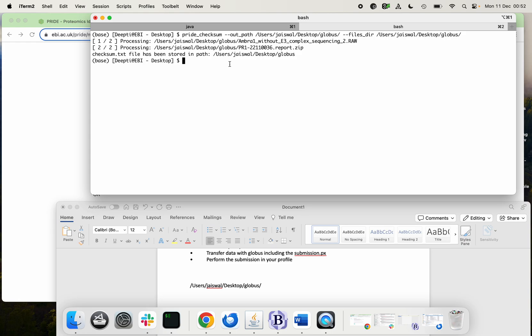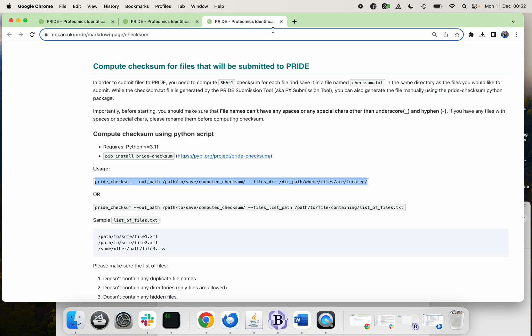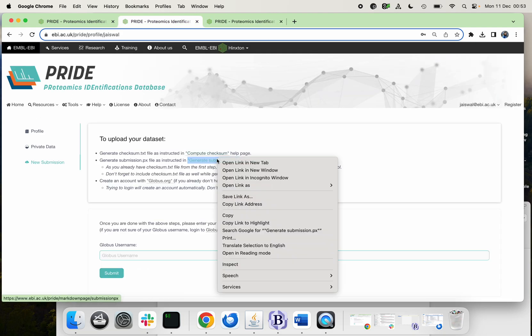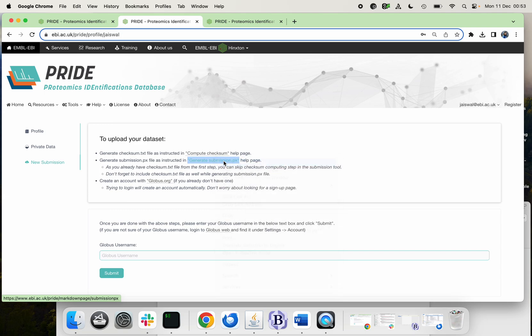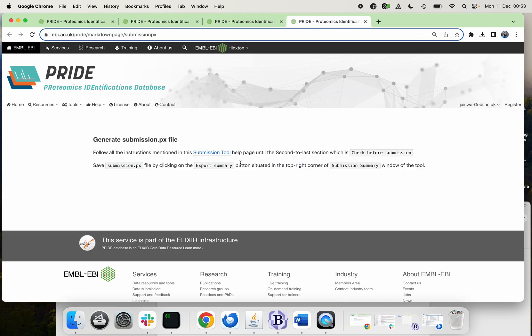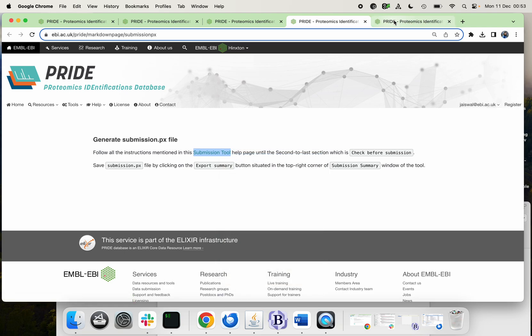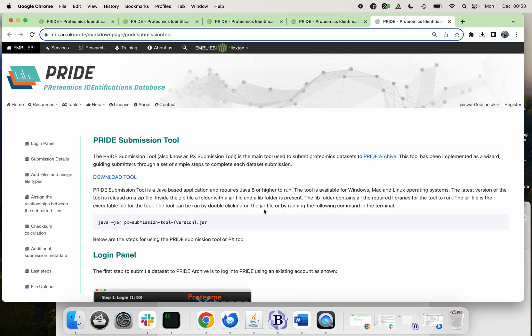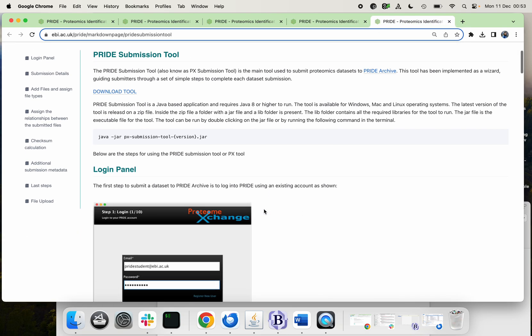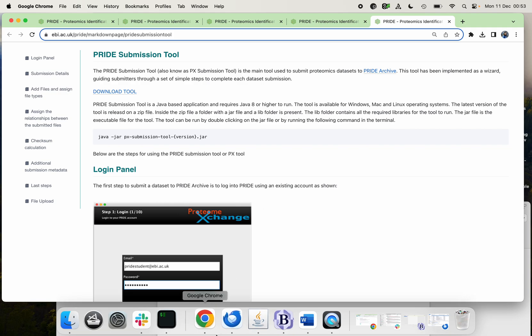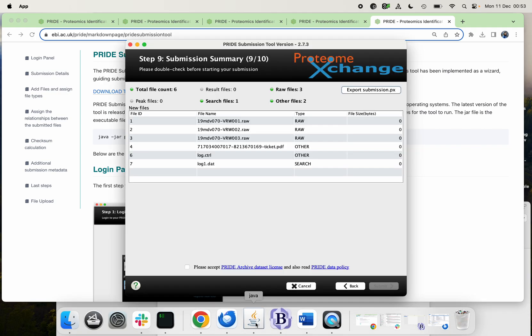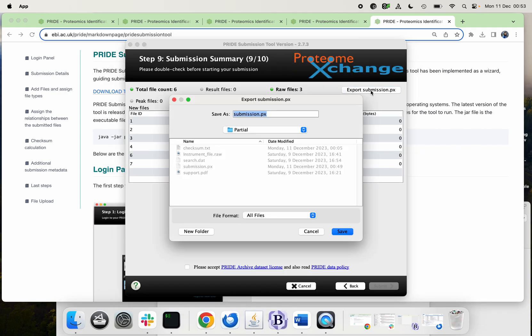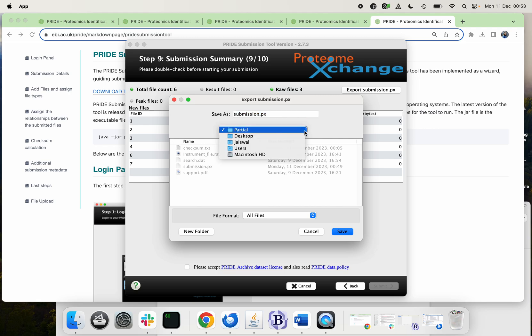Now the second step is you need a submission PX file which you can do with the PX submission tool. So you just need to install the latest PX tool and follow the steps in order to generate the file. It will look something like that. At the end you just need to export it, and again I'm going to export it at the same place where I have kept all my other files.